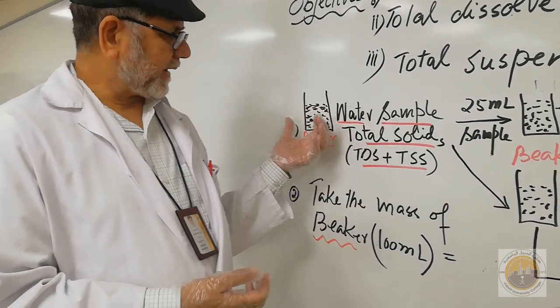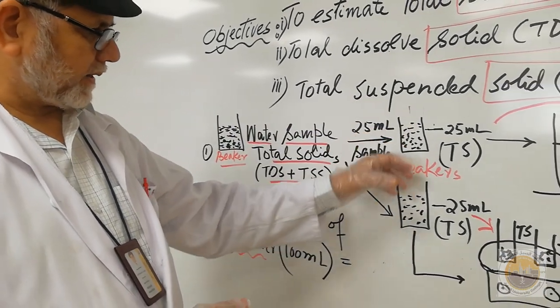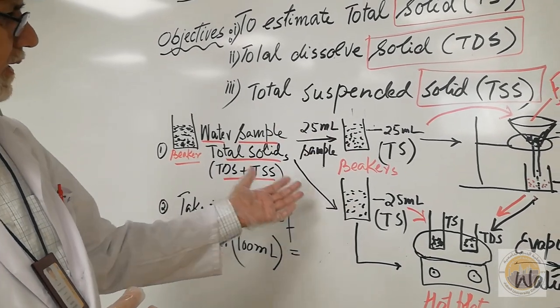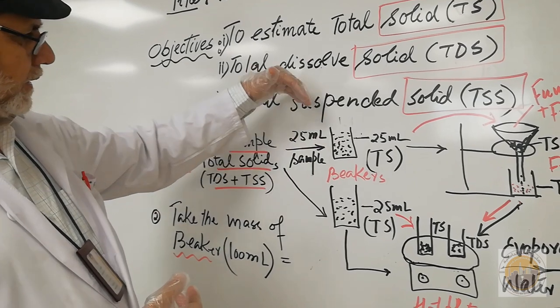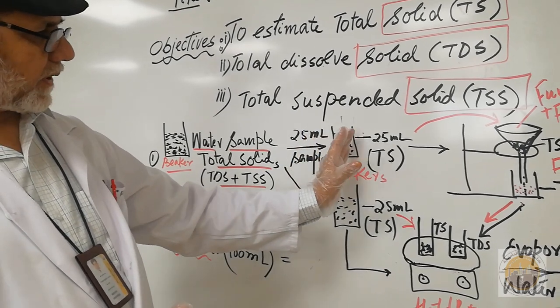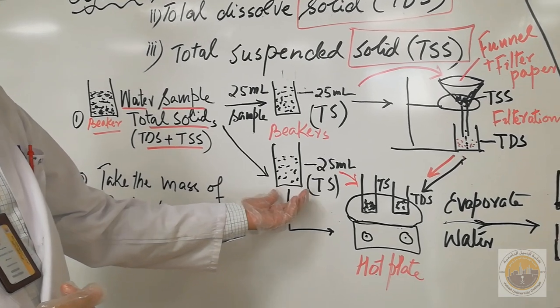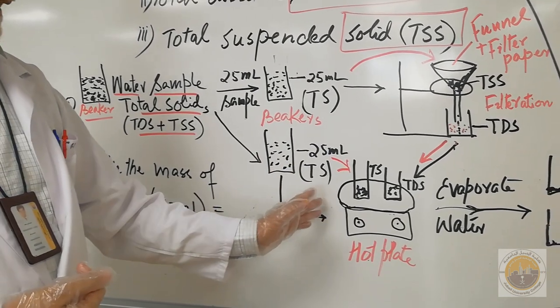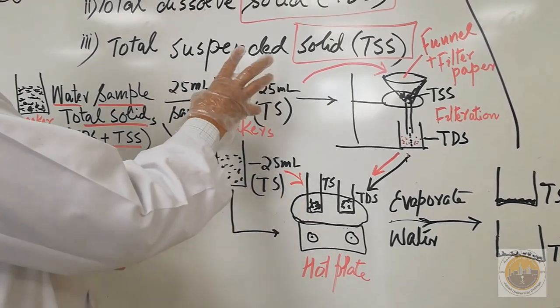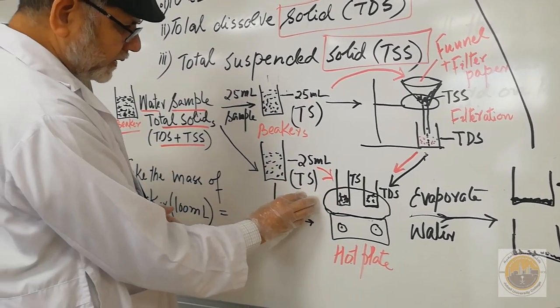From the sample we take 25 ml into two different beakers, which we have already weighed so we know the mass of each empty 100 ml beaker. One beaker is for TS and the other for TDS. Both start with the same 25 ml sample containing TDS plus TSS.